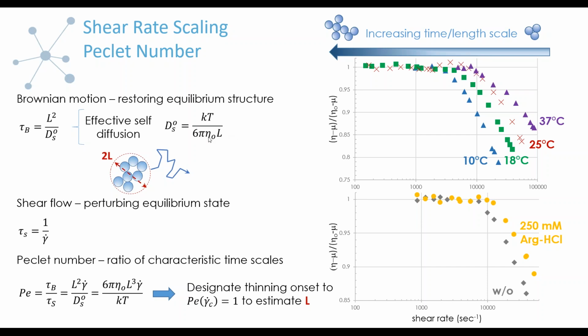So I had brought up originally that when we're looking at the temperature dependence, we have to ask what portion of this change in rheological behavior is coming just from temperature, and what is coming from a potential change in aggregate structure due to a potential change in the interactions that might occur due to, for example, changes in extent of hydrogen bonding. So I wanted to point that out just so you understand why it wasn't immediately clear what was fully responsible for these variations in rheology with temperature change.